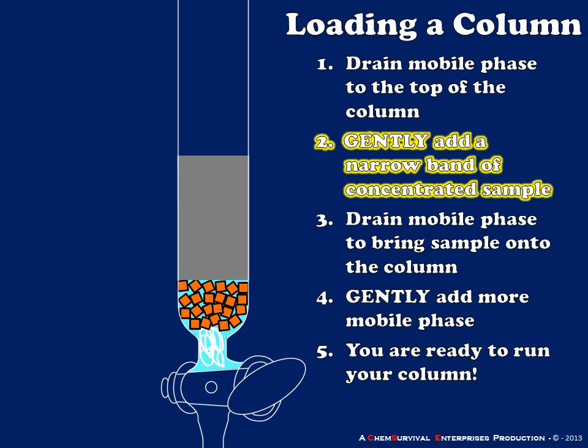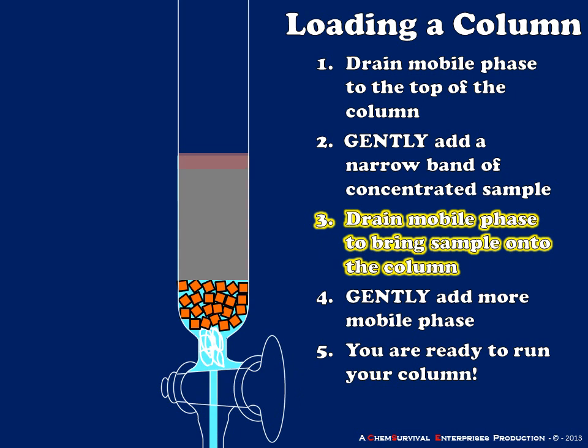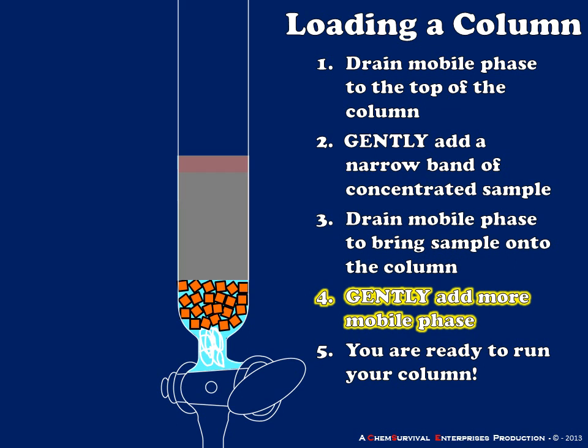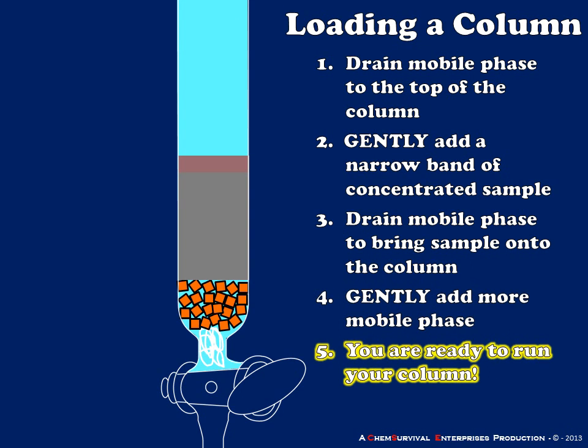Next, I'm going to use a transfer pipette to gently add a narrow band of concentrated sample to the top of my column. At this point my sample is resting on top of the column but is not actually in contact with the stationary phase. I need to get my sample in contact with the column before I add any more mobile phase — I accomplish this by draining the mobile phase again just to the top of the column. Now I have all of my sample in contact with the stationary phase, so when I add additional mobile phase I don't dissolve my sample into the pool. I'll gently add additional mobile phase and my column is now ready to run.